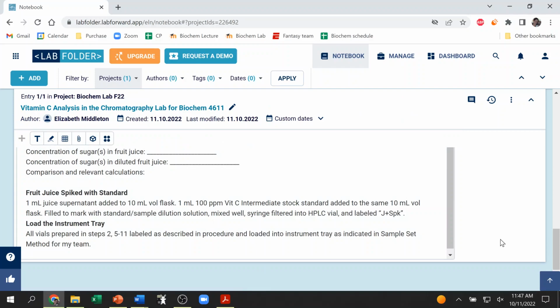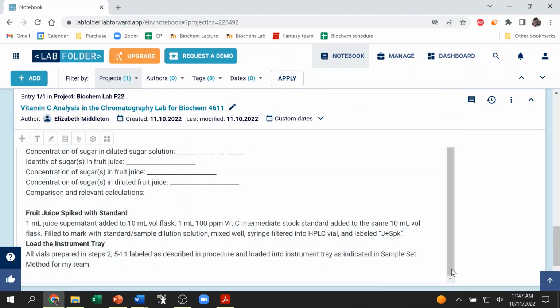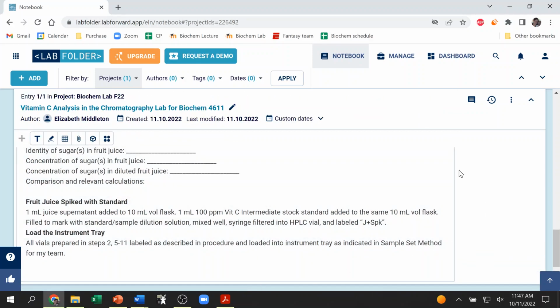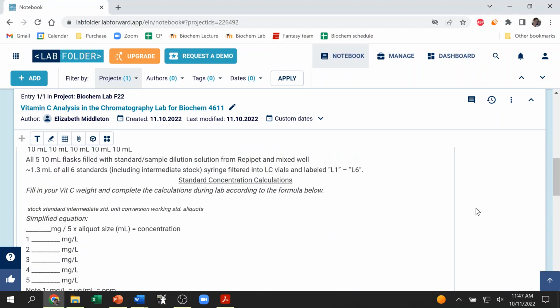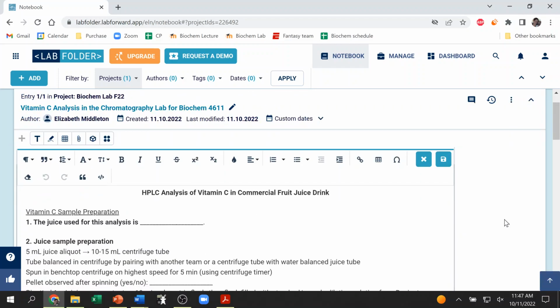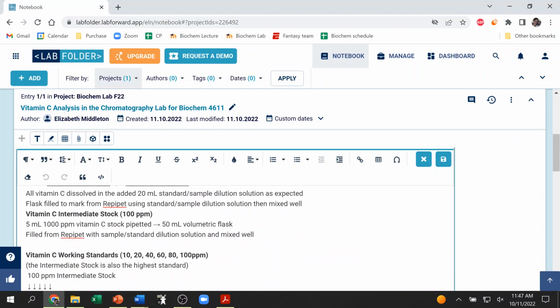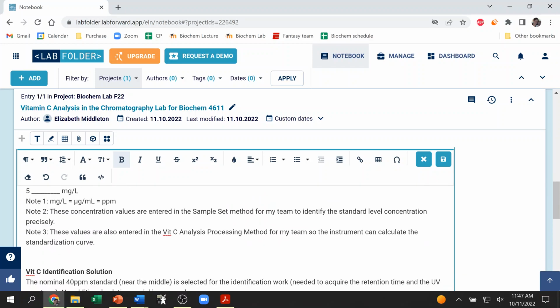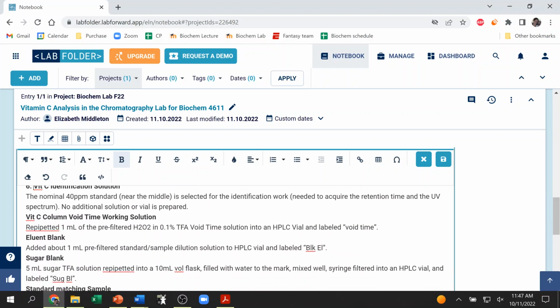All right, so that's the whole procedure. Let's do a little more. I was waiting for that extra scroll bar to go away. So now we know we're displaying the whole thing. And it should just make it a little easier to edit. So I'm going to go through and number all of them the way they were before. We're not going to do every single step here together, but I'll do enough to get you started.